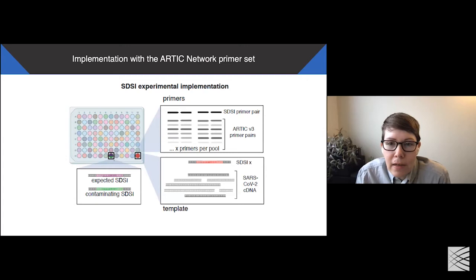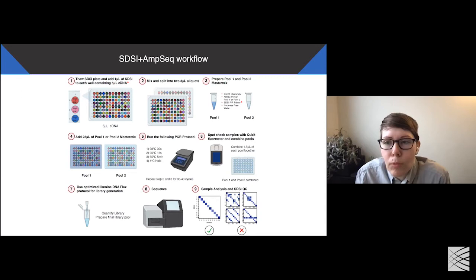This would allow us to amplify both the SARS-CoV-2 genetic material and the SDSI simultaneously. If two SDSIs, or the incorrect SDSI, is then detected during sequencing, that individual sample can be removed from analysis. We term this approach SDSI plus AMSeq. The entire workflow begins from cDNA generated from that NP swab and tracks the samples during the amplification stage where the highest risk contamination occurs. SDSIs are added into the cDNA. The sample is split into two for each primer pool. 35 to 40 cycles of PCR are done, and then after amplification the pools are combined. The libraries are quantified, pooled, and put on a sequencer. The addition of the SDSIs adds minimal extra cost and time to the already existing workflow.